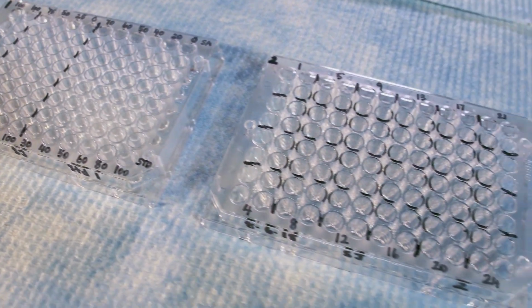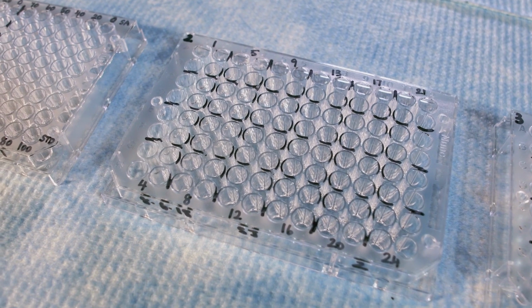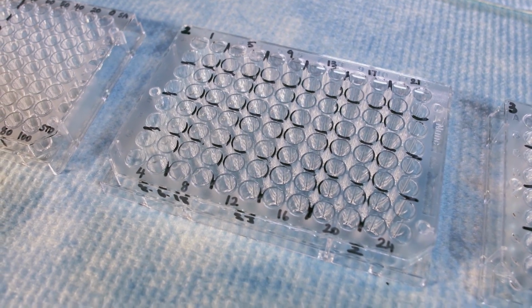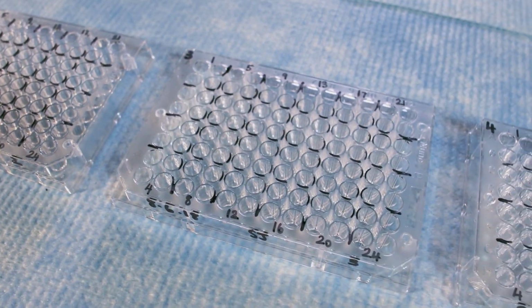To help with correct transfer of diluted samples into the plate, divide the plate into columns and rows as shown here. Each sample will occupy 4 wells. Use a marker pen to label the sample number on the sample plates.